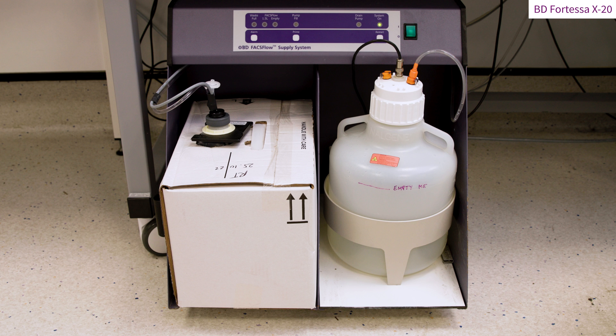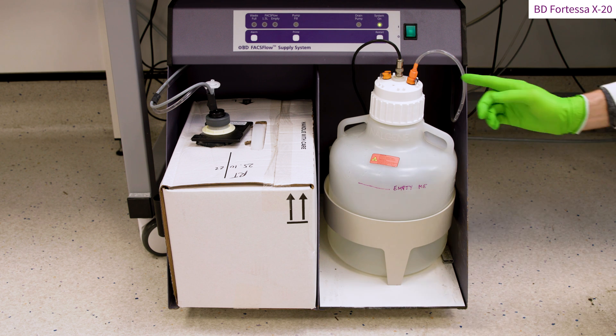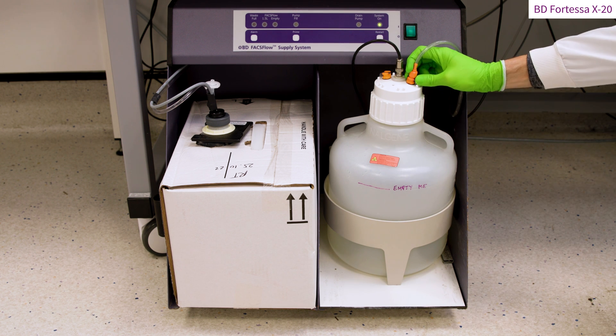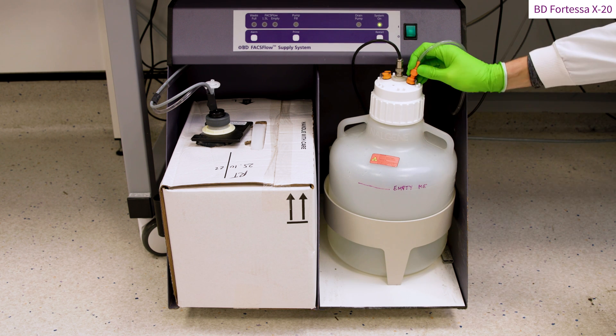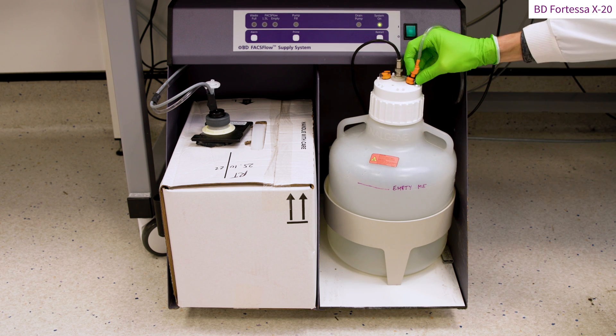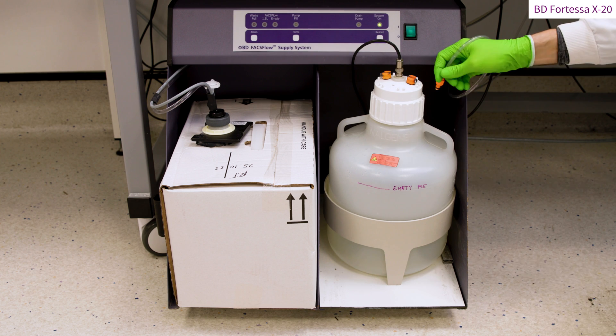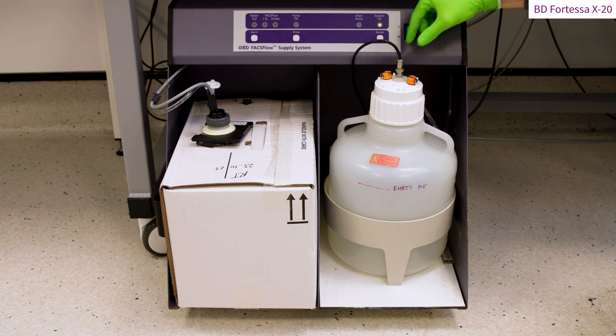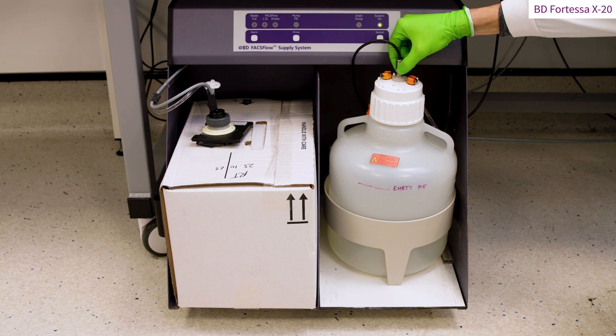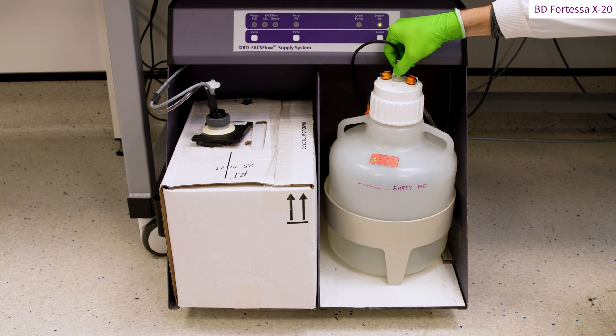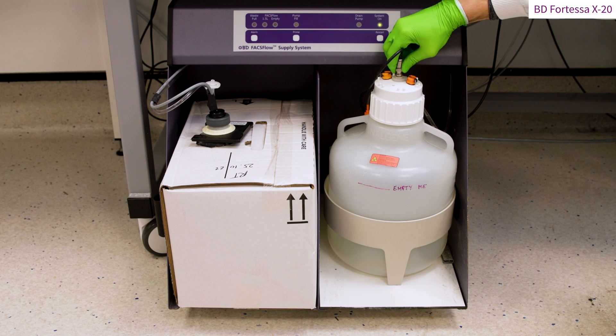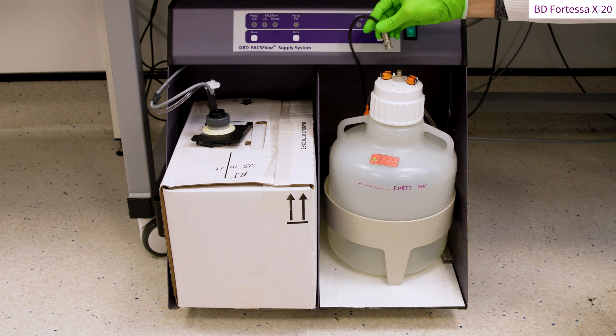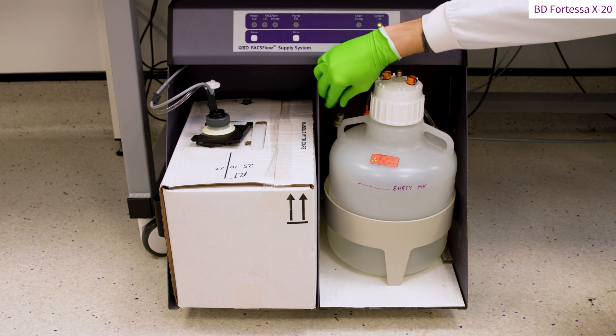Always empty the waste tank as it approaches 80% full. Disconnect the orange connectors and the level sensor line by pushing the metallic connector down and rotating it a quarter of a turn anti-clockwise. The level sensor line can be safely placed at the back of the fluidics cart.